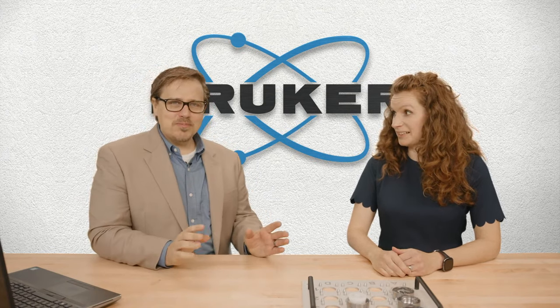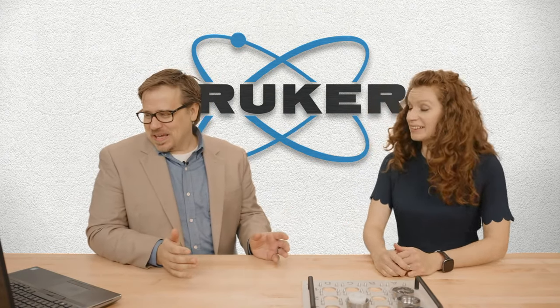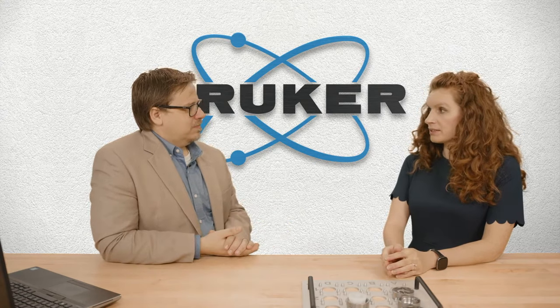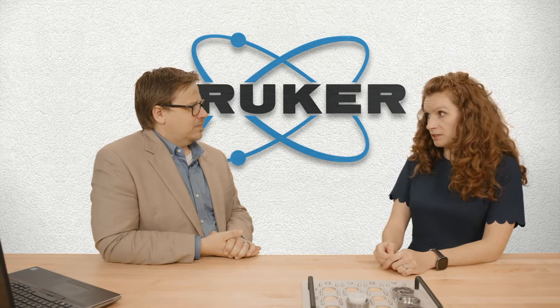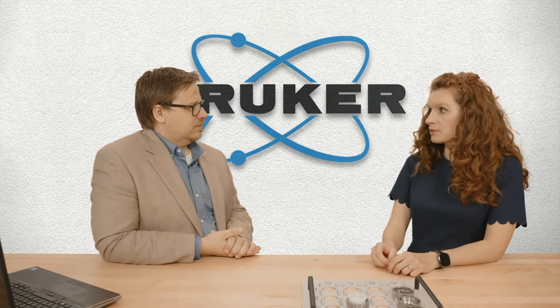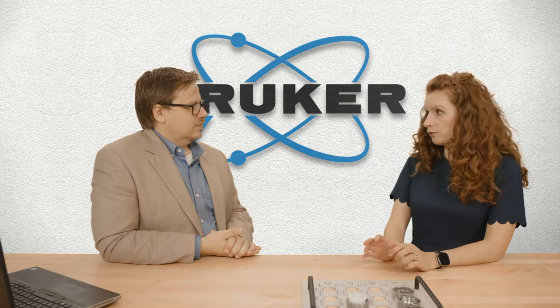Okay. So, actually, one question that I have now, I'm not the expert in the XRF, is I hear this pressed pellet, fused bead. Which one actually, why would you do one thing versus the other? So, pressed pellet gives you higher intensity, so it's very good to measure traces. Okay. But fused beads melt your samples. So, they get rid of all of these mineral phases.